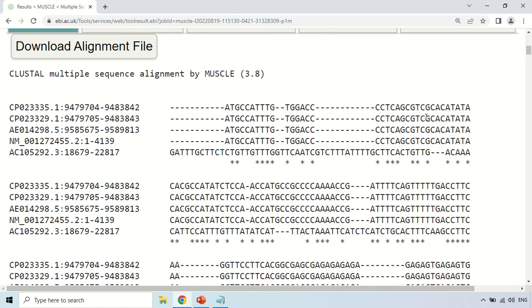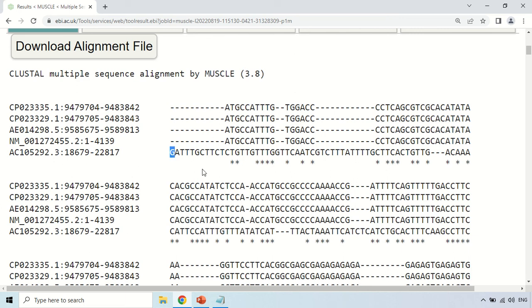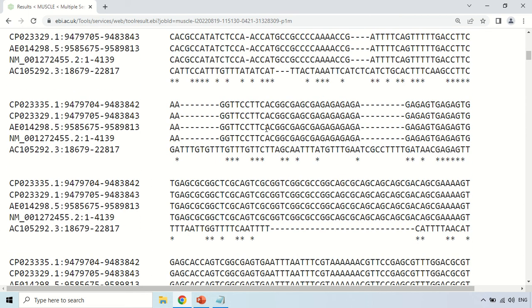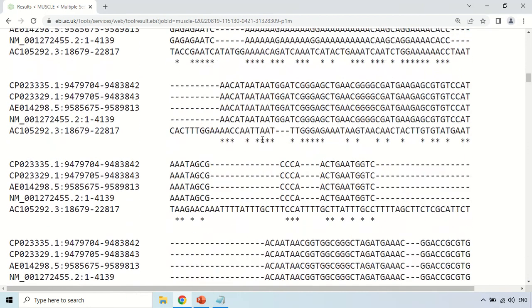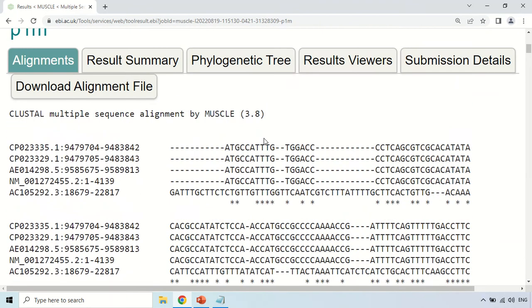Where a star is not present, it means one or more nucleotides are different in one or another nucleotide sequence. These dashes represent gaps, because the software did not find any nucleotide corresponding to those nucleotides in other sequences. So dashes mean gaps, and stars mean conserved. By scrolling down, you will find the result of your multiple sequence alignment under the Alignment tab.